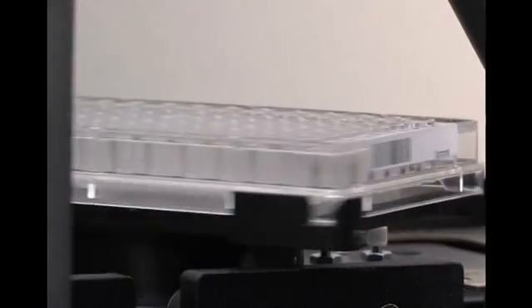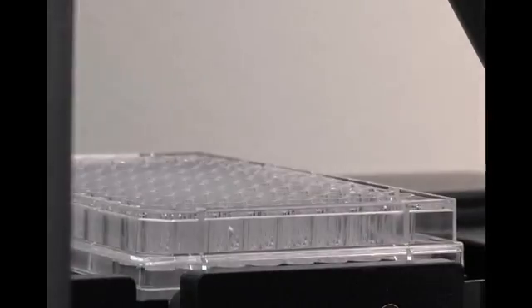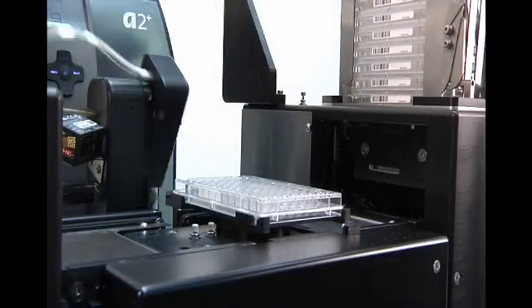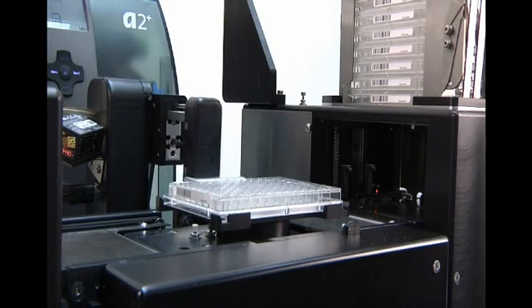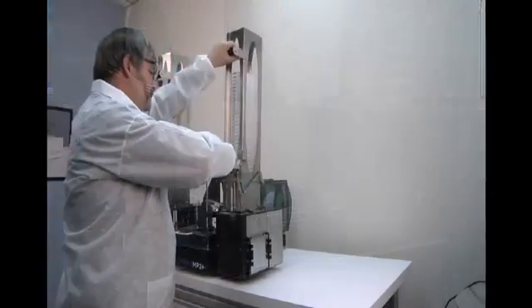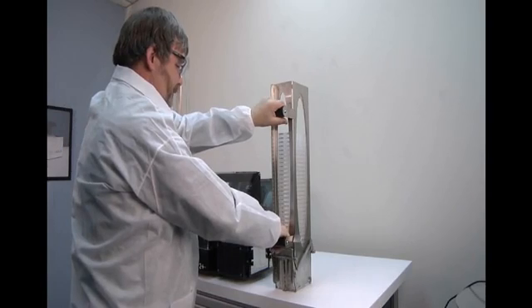The system comes standard with a 300 dpi resolution thermal transfer printer. A 600 dpi option is available. If required, plates can be labeled using data that has been automatically retrieved from an external LIMS or database. Once the run is complete, the labeled plates are easily unloaded from the stacks.